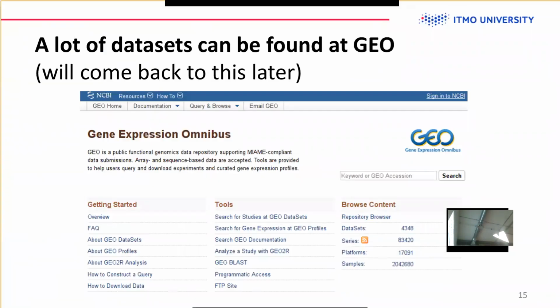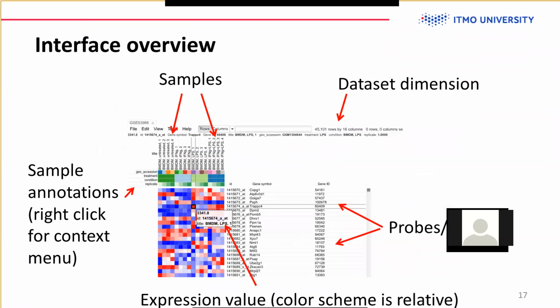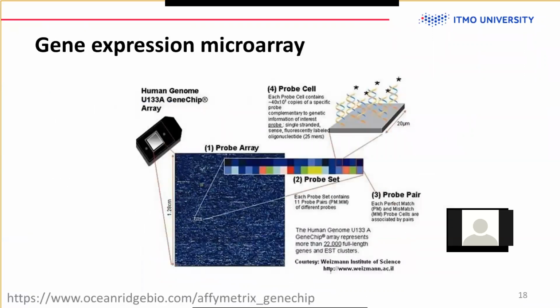There was a question in Zoom: why do we always have some signal, even if there is no gene? It's because of optics. You have one particular spot that is not fluorescent, but the spots adjacent to it are fluorescent because they bind to some gene.